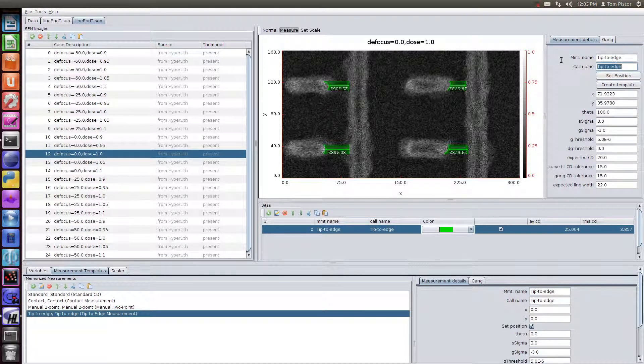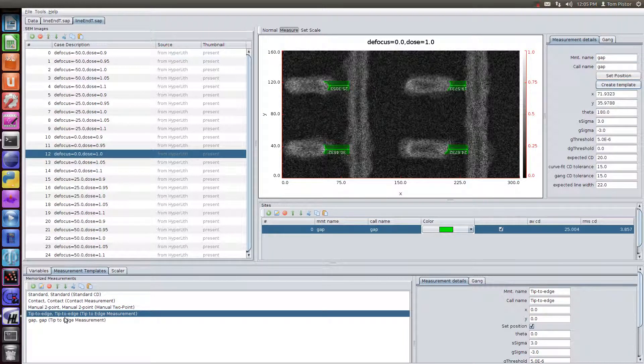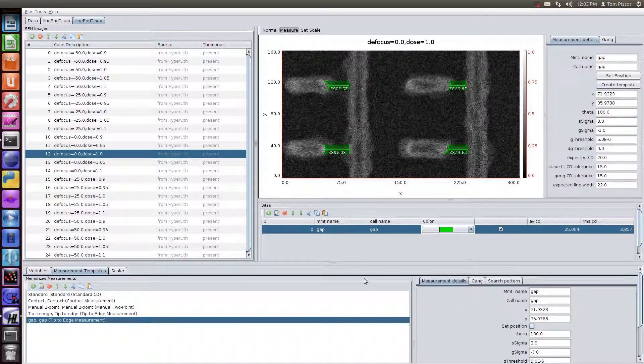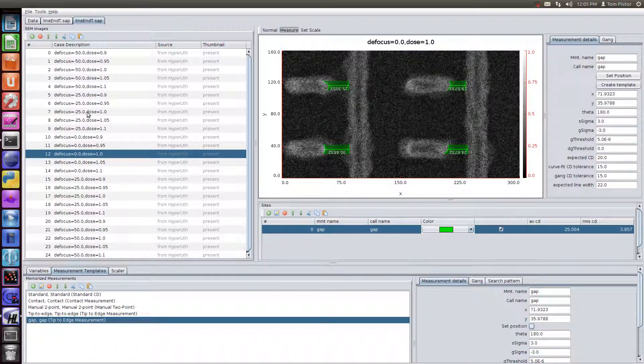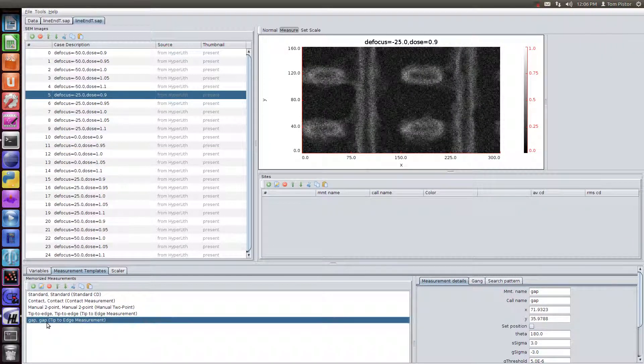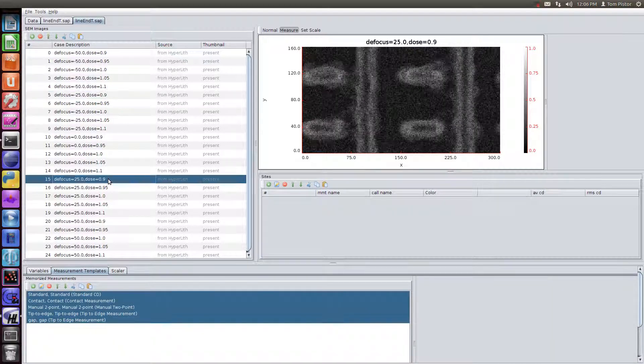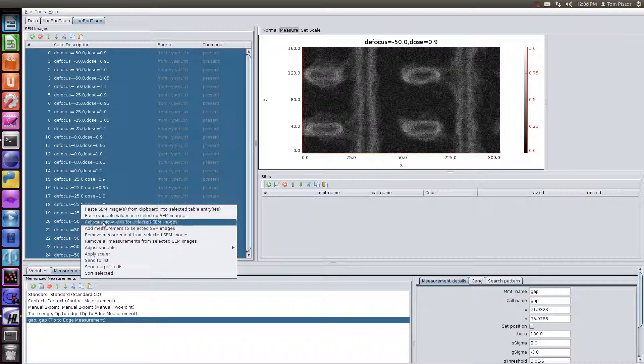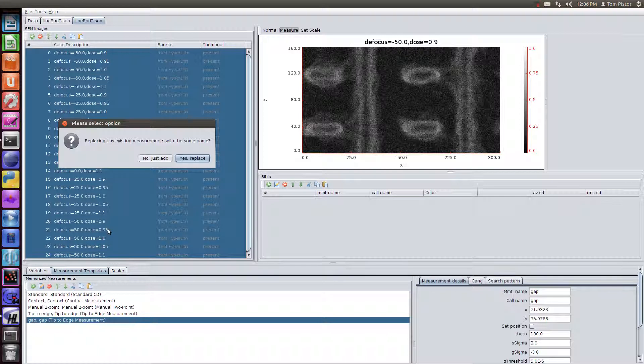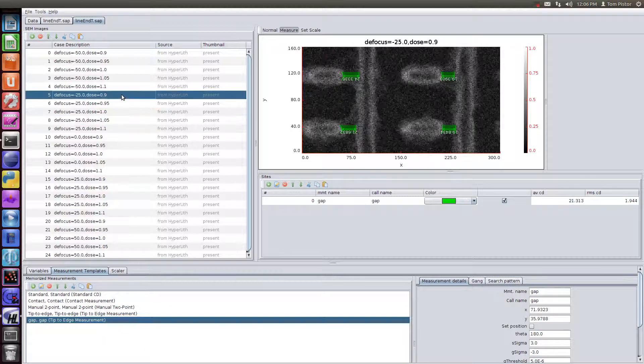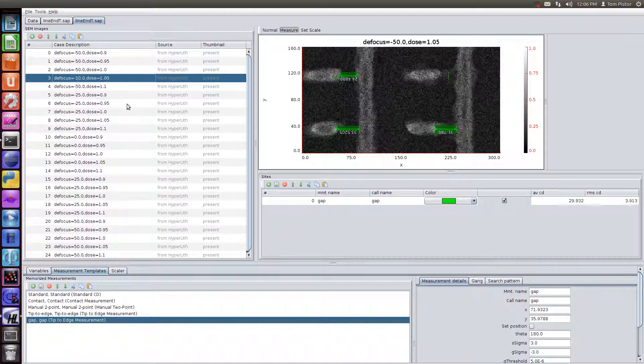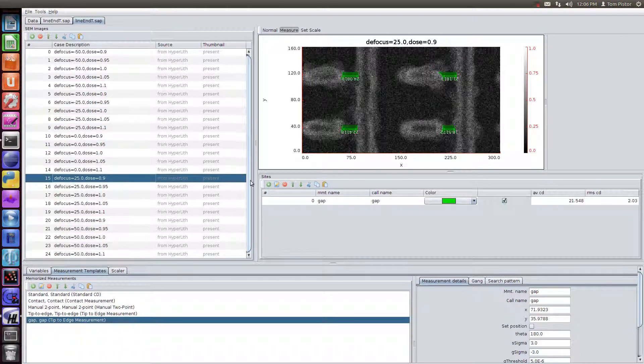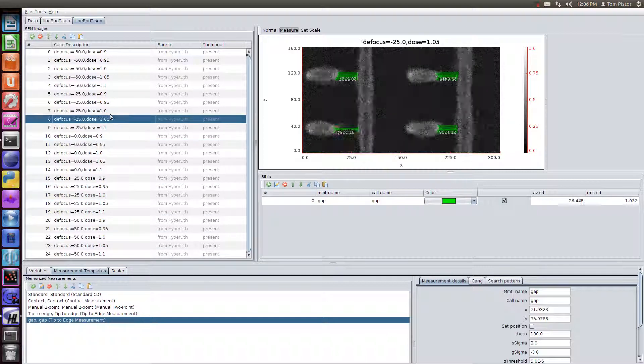Now we can turn this, let's call this a gap. So we're renaming the measurement. And then we'll create a template from this. So now in our templates, we have a thing called gap. I'm going to remove the set position because we don't want to set the position when we apply this. So now we're going to apply this template gap that we just created to all of them, all of the SEM images. So we select all of them. And we say, add measurement to selected images. The measurement name is gap. And we're going to replace any instances of gap that are already there. And now you see that all of these have been measured with that same. So we've applied this to all of the measurements. So now or all of the SEM images.